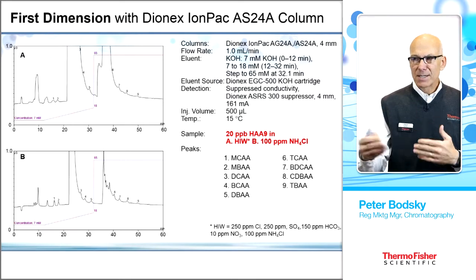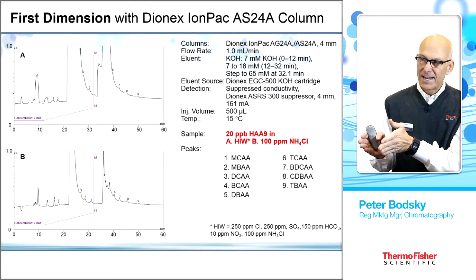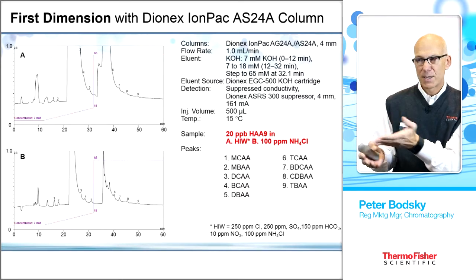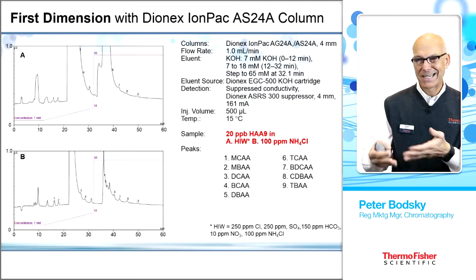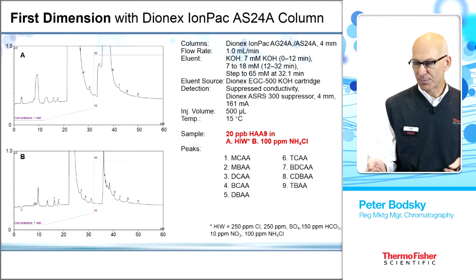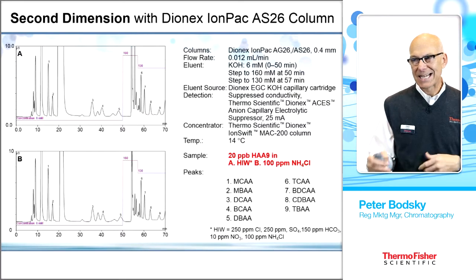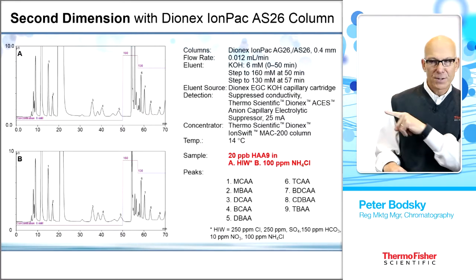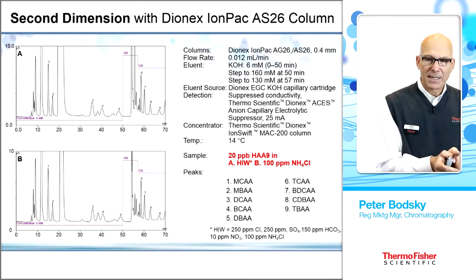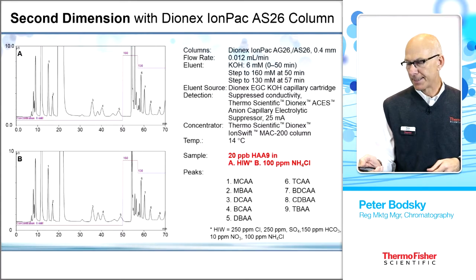So in the absence of the second dimension, you can see these peaks would actually be very difficult to quantitate. There's a lot of peaks that are actually on the shoulder of the larger peaks, which makes quantitation nearly impossible. And so this, again, in the first dimension, if we were trying to quantitate something in the first dimension, would be next to impossible. If we do now a look at the second dimension, you can see that same chromatography now processed through the second dimension of the system, and the peaks are much better, they're much sharper, they're much easier to integrate, which is ideal for anyone that's trying to quantitate the haloacetic acids.